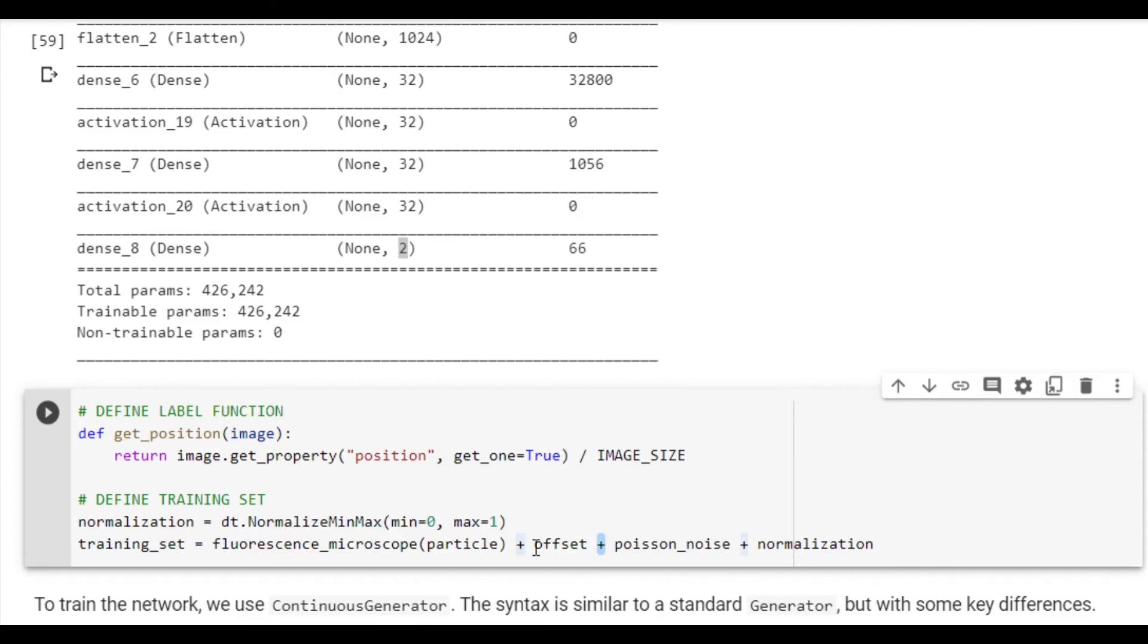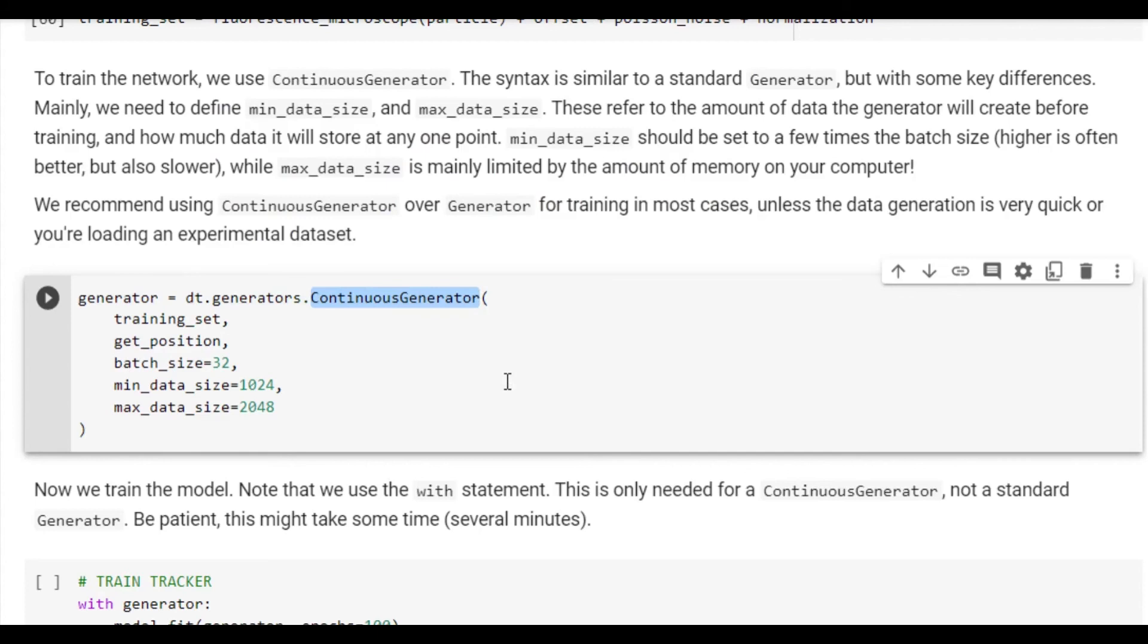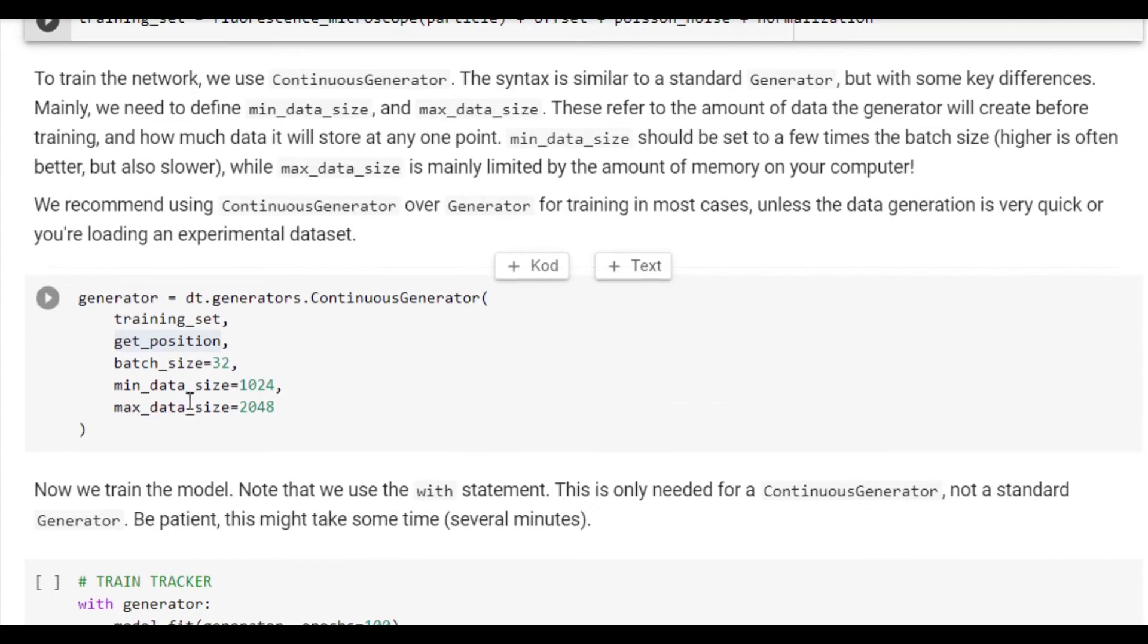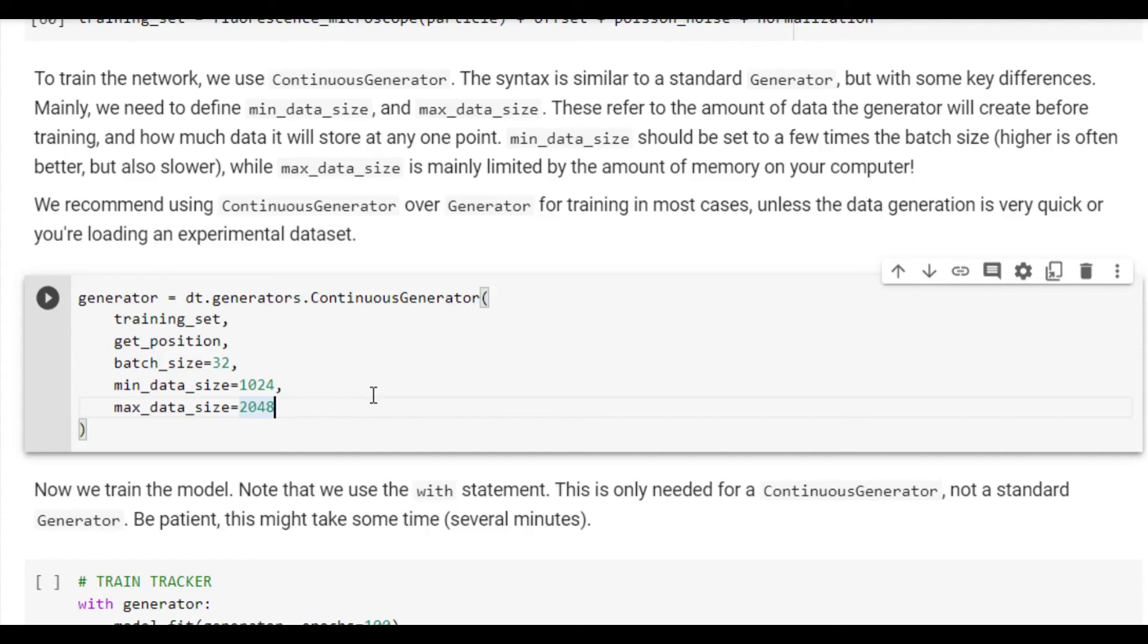We also need to define a data generator, which is how other packages can request images from DeepTrack. In this case, we'll use continuous generator, which is a very fast generator designed to create training data for neural networks. For the first two arguments, we'll pass the training set feature as well as the getPosition function that we just defined. We'll also set the size of each batch that the generator creates. Finally, we'll also need to define minDataSize, which is the minimum number of images that the generator will create before starting training, as well as maxDataSize, which is the maximum number of images that the generator will hold in memory at any one point. It is usually a good idea to set the minDataSize to be at least 10 to 20 times the batch size, while the maxDataSize is mostly bounded by the system memory.